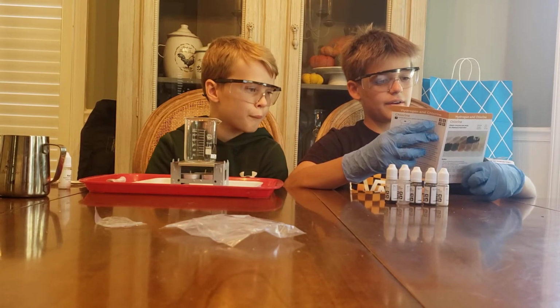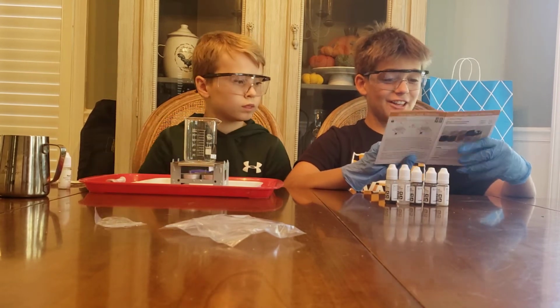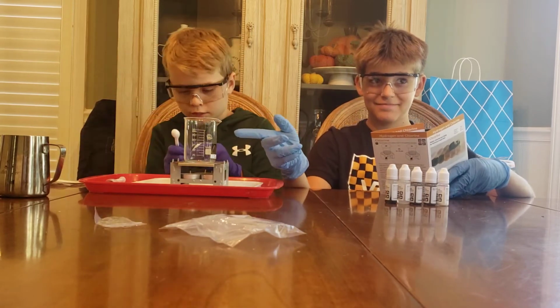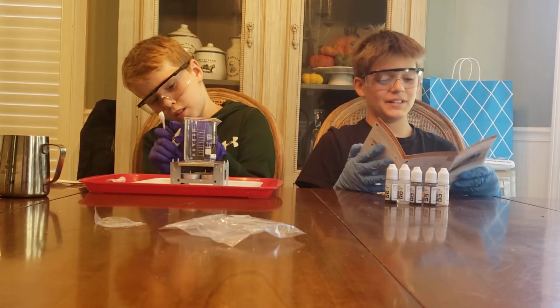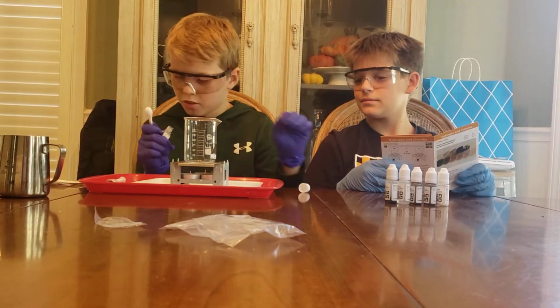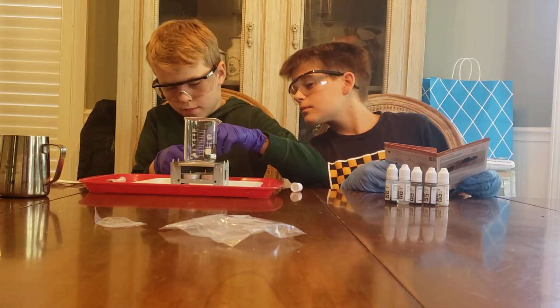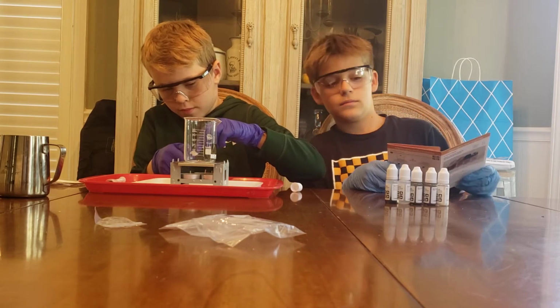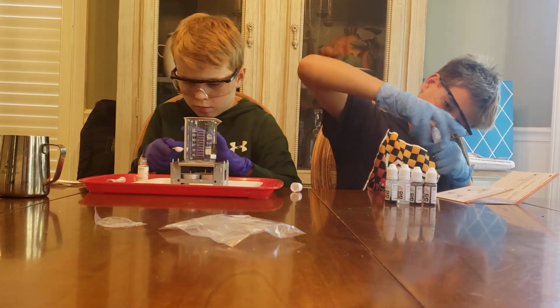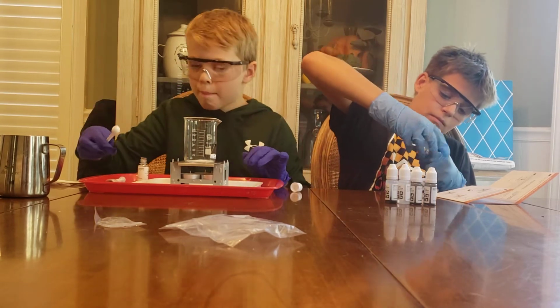Take one big spoon of NaCl and put it in the flask. That's what I'm gonna call it. Trouble opening this. Oh, okay, I didn't have that much trouble. One big spoon.